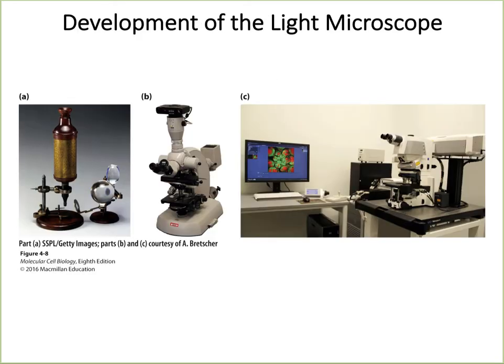The early microscopes, like the one used by Robert Hooke, used lenses or a mirror to illuminate the specimen and first revealed the existence of cells, which revolutionized science. Development of optics and light microscopes during the 19th century led, by the mid 20th century, to a highly sophisticated microscope, but limited only by the resolution of light.